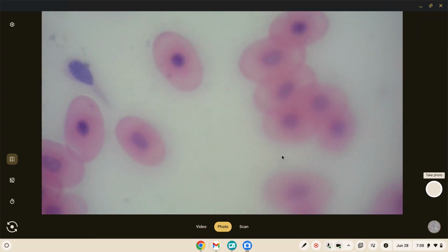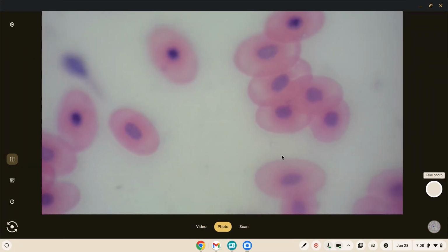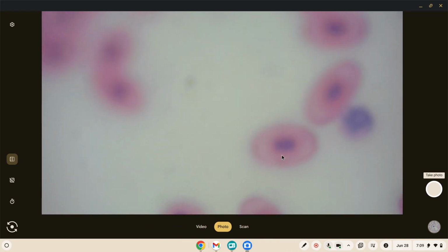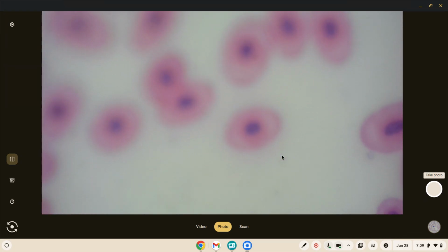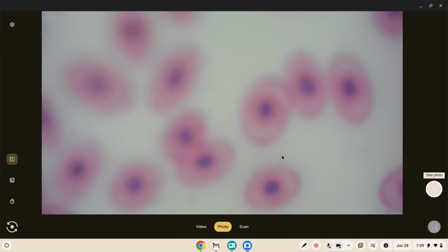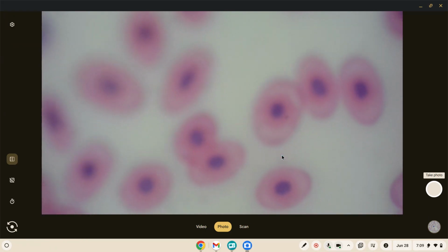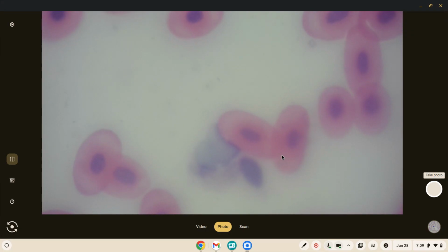And we're in the frog's blood. Let's get to the correct magnification, and wow. Let's just take a look at this. What do we see here? Well, the first thing we see are a whole bunch of red cells. Those are probably blood cells, right? Well, let's take a look at them and find out if they really are blood cells.